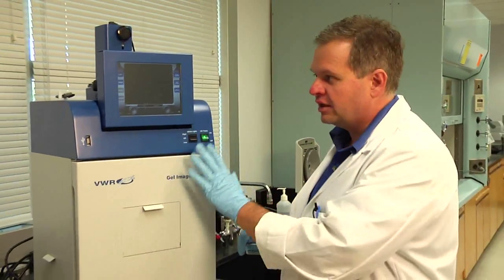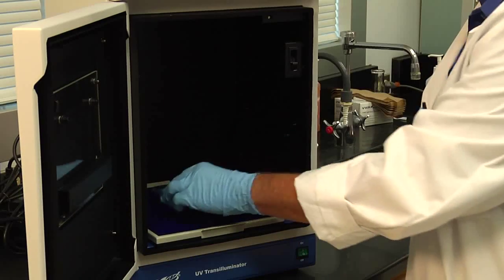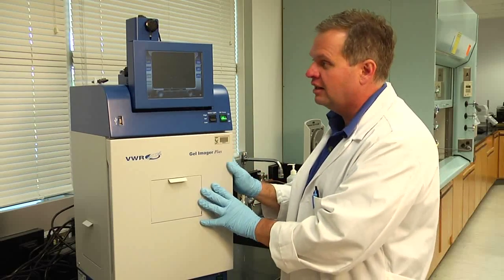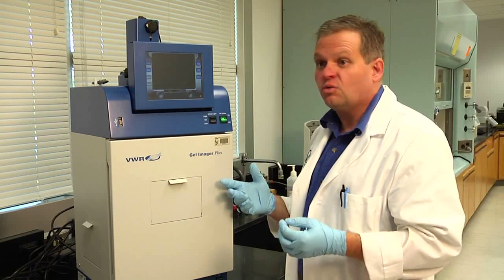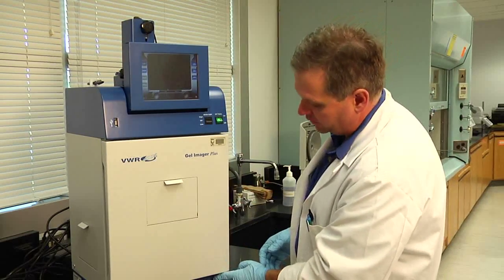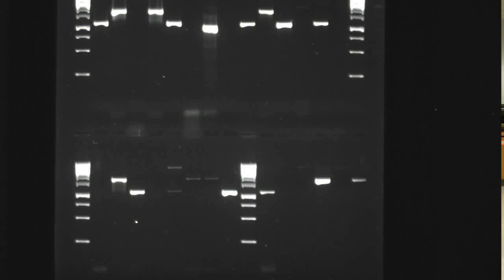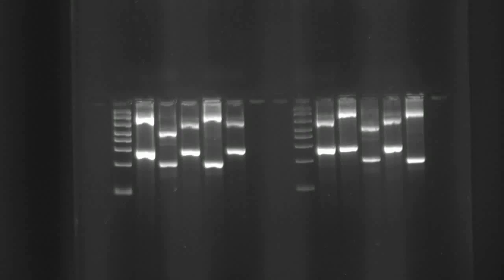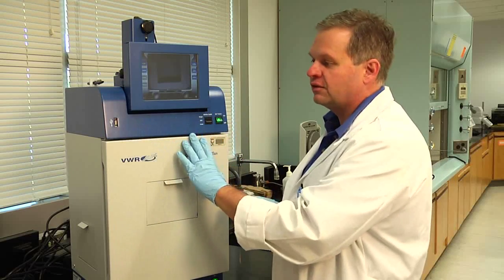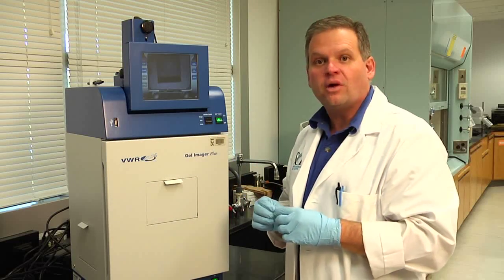After we've run the gels, we're going to bring them over to our gel imaging system. This is all about documenting our work — proper documentation and recording of what the students are doing is not only an important teaching opportunity, but it's also what you're going to be doing in a research lab or research position. What's really nice about this system is it has features that allow us to look at DNA, protein, and RNA, and document them with a great CCD camera. We can snap a picture with different lights and filters, dump it to a USB drive, and students will be able to take it away and analyze it.